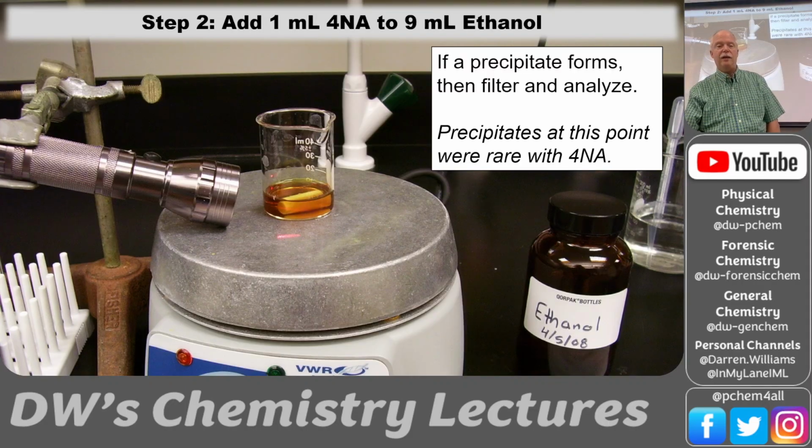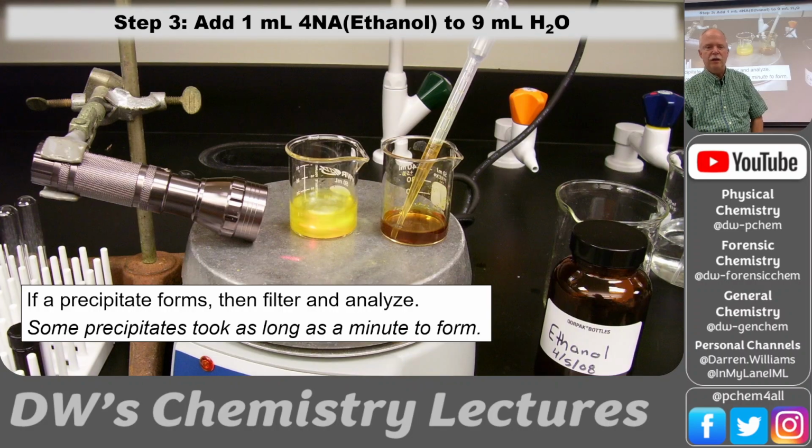So here was our apparatus. And we kind of used the laser. This is a flashlight, but it has a laser in it. So you can kind of see the laser light there. And so we don't see a lot of scattering. And then when we see the precipitate crash out, I thought we might need the laser to see the particles, but no. When it crashed out, it became a milky yellow solution. So that's what it looks like when it crashes out of solution.